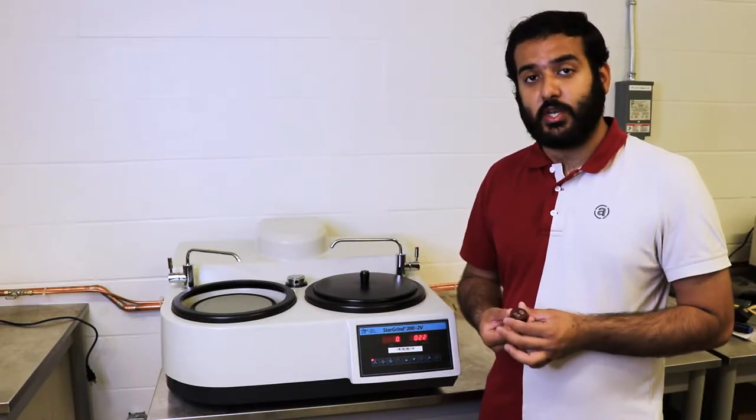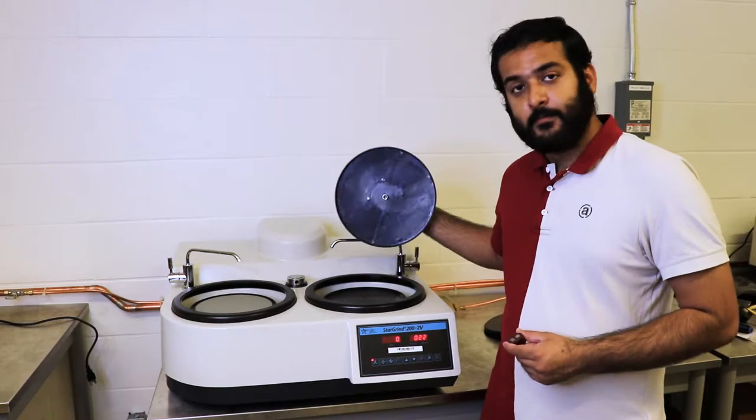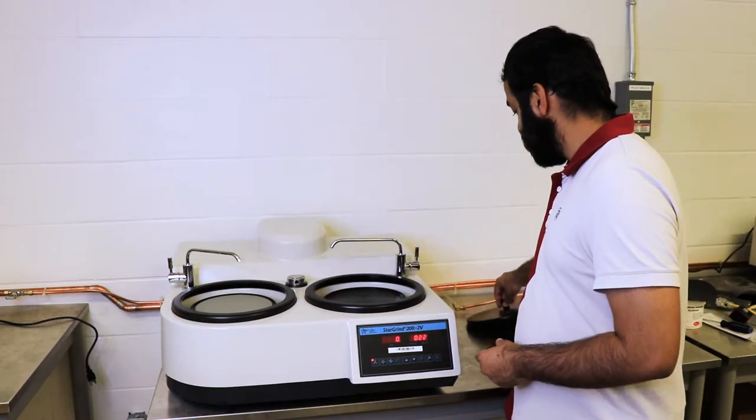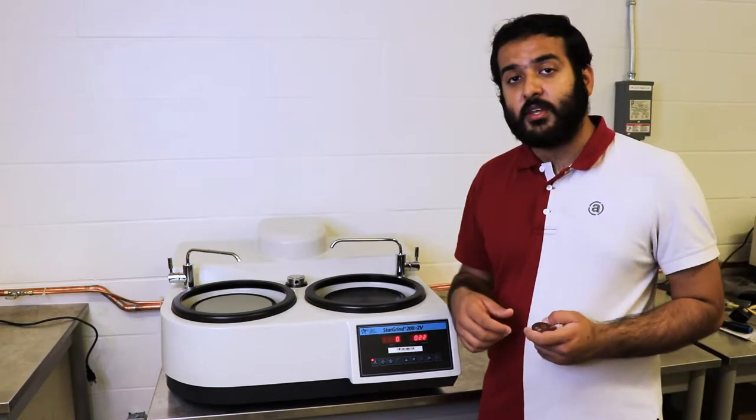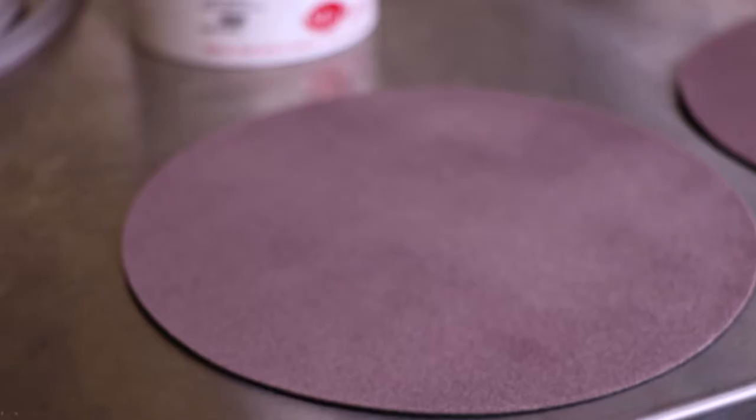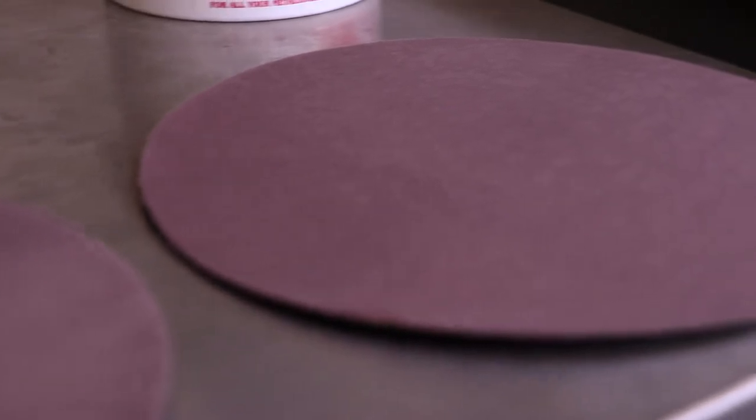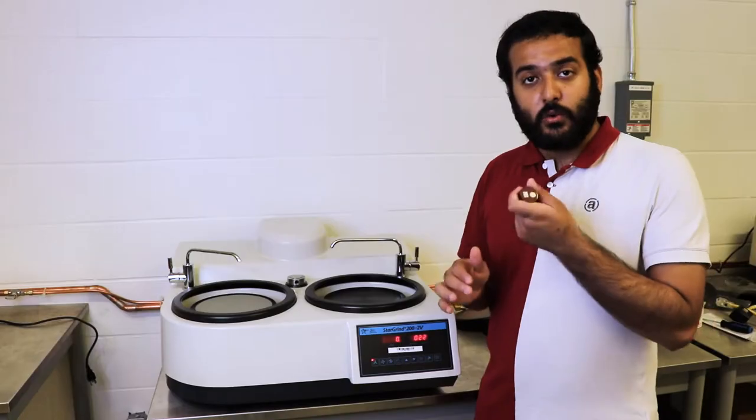Now that we're done grinding our sample, we can move on to polishing it. We're going to use the other head of the machine. I'm going to use a polishing pad instead of sandpaper. A polishing pad is basically a fabric in which we apply powder and liquid to make a paste that can more finely grind the surface of your sample.